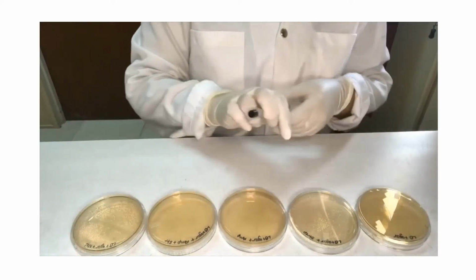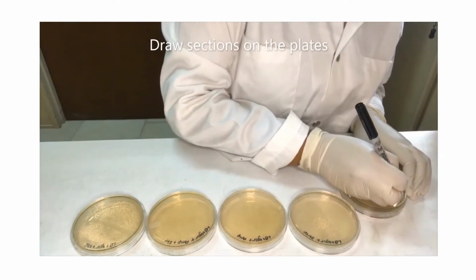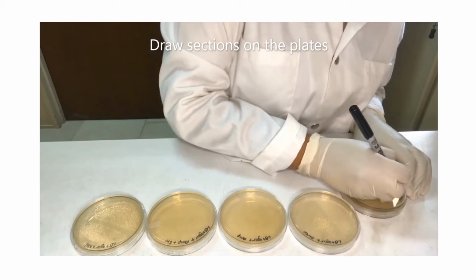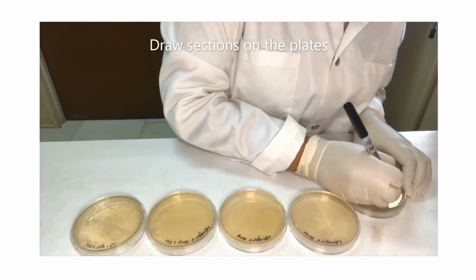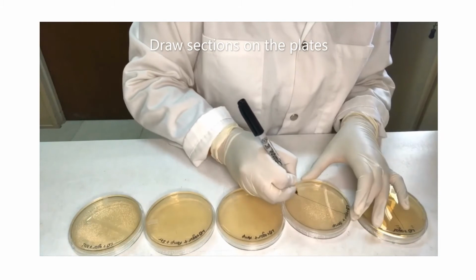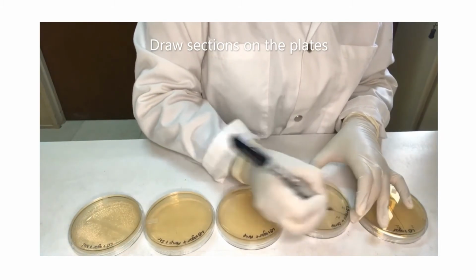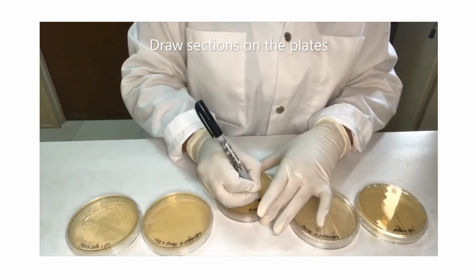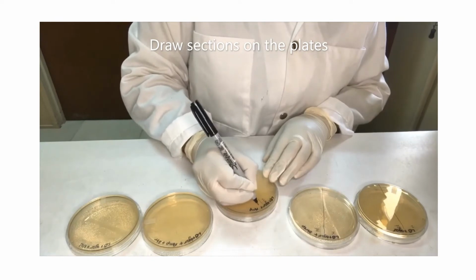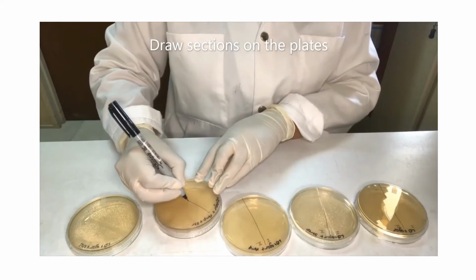Here, the video for Lab Day 1 is demonstrated. The 5 agar plates are laid out in the same order as seen in Figure 2 in your lab manual. The technician then proceeds to divide each plate into their respective regions. Region 1 is labeled with Roman numeral 1 and region 2 is labeled with Roman numeral 2. A line is drawn on the bottom surface down the middle of each plate as seen here to divide the plates into the two regions.